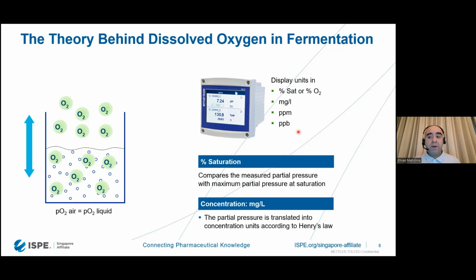concentration. However, our measurement technique, our DO probe, let's say, that is measuring the dissolved oxygen in the aqueous form, is still only measuring the partial pressure, essentially. And the presence of oxygen there depends on how much transfer there is from the gas bubble into the liquid phase. So the easier way to go about it, and a little bit less precise way, let's say, is to compare the dissolved oxygen presence to whatever we have at saturation and the zero point when there is no oxygen present.